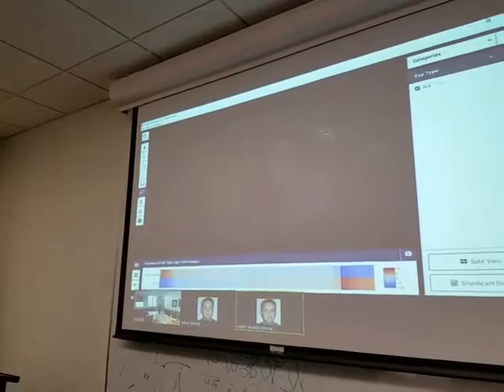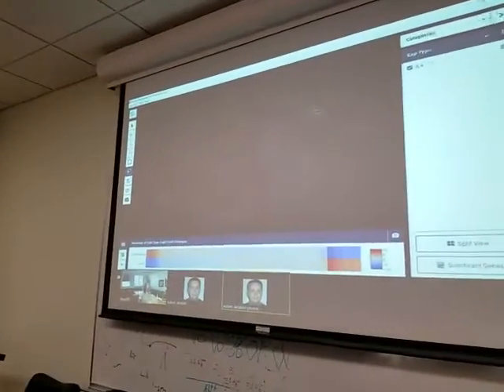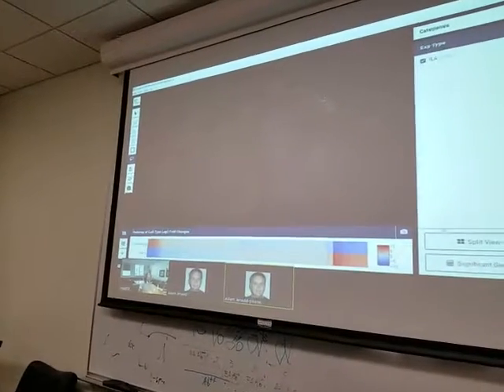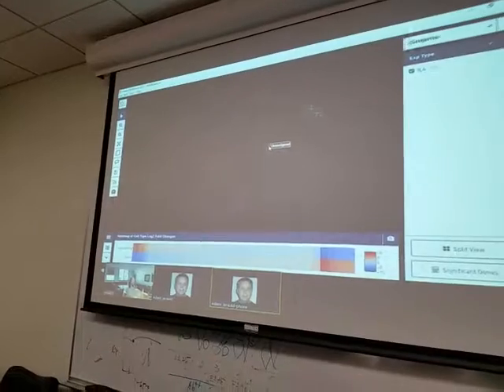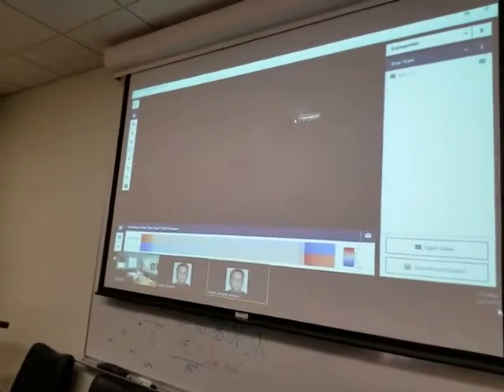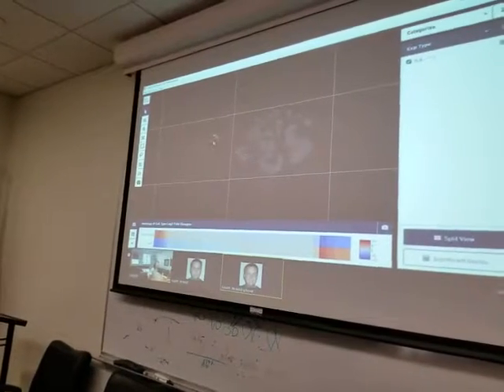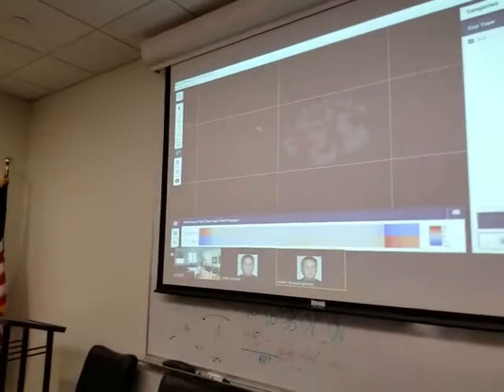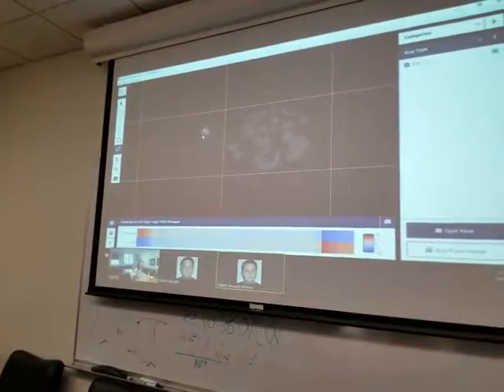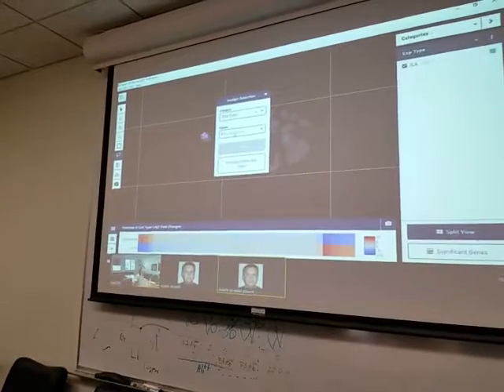Adam, try to use a split view. That might help. Split view. Oh yeah. So when you do split view, what you're doing is almost like a karyotype. Yeah, right. Laying things out. Yeah, thanks, Evan. That's perfect. So if I do split view, and then you can get again. Yep, and then we can lasso. Yeah, there you go. Perfect. Thanks, Evan.